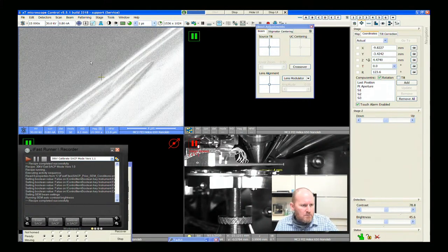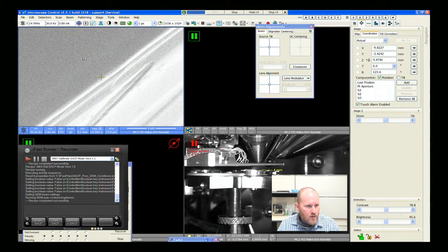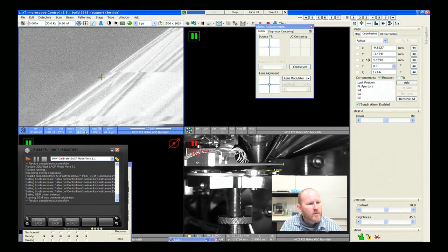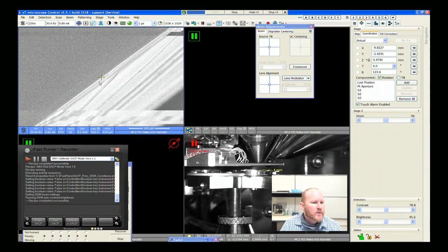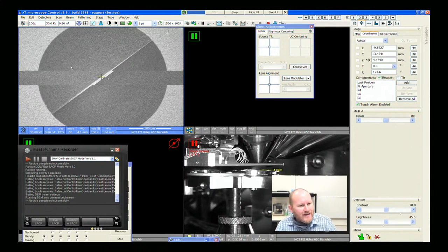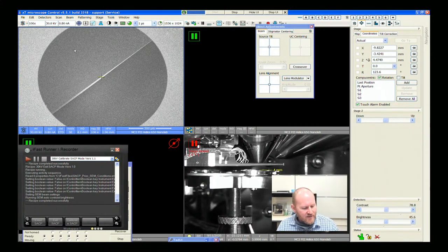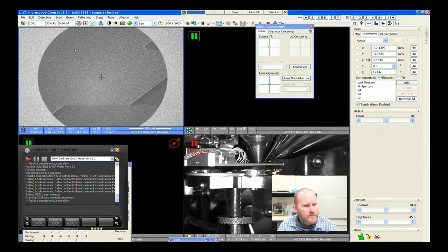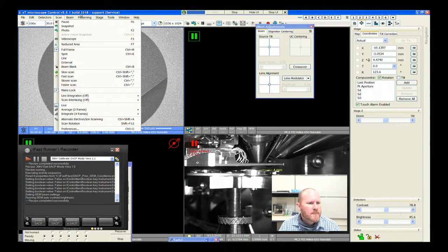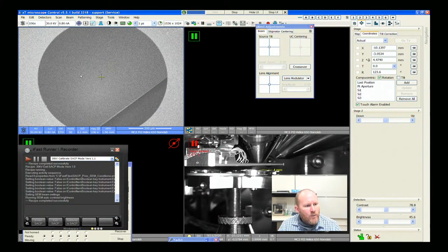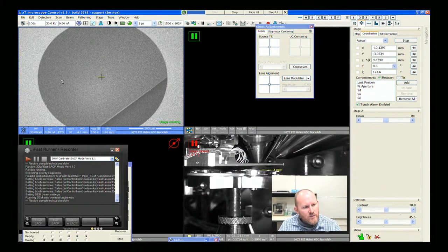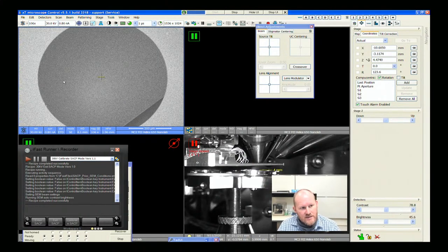One of the most important uses of SACP is for EKI — electron channeling contrast imaging. What SACP mode lets you do is determine the crystal direction without having to use something like EBSD. Then you can do some true dislocation imaging.